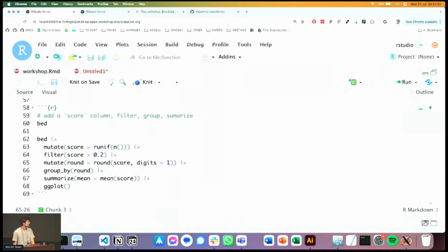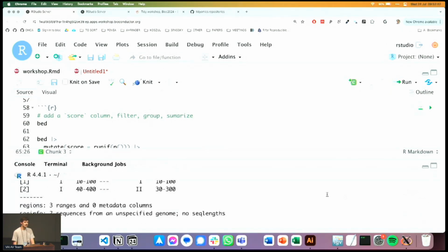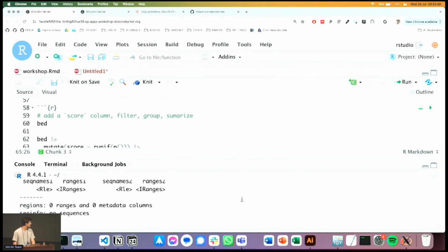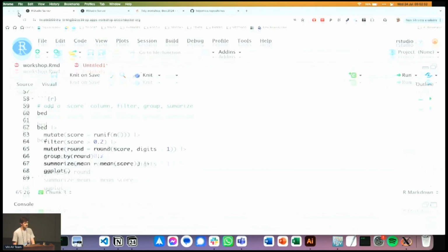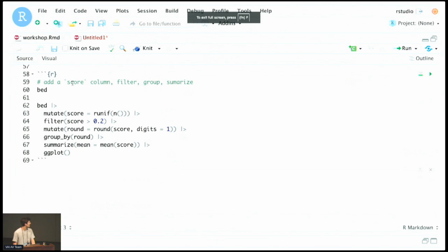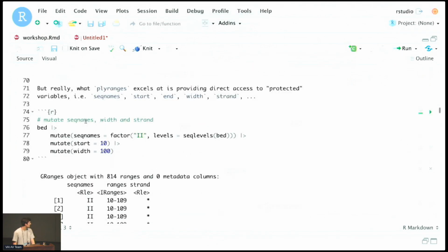Yeah, am I the only one who's having trouble? Okay, I probably pressed the wrong key. You should go back to the view before, so you don't show your... Sorry, yeah? Oh, good. And it looks like the libraries are still there.